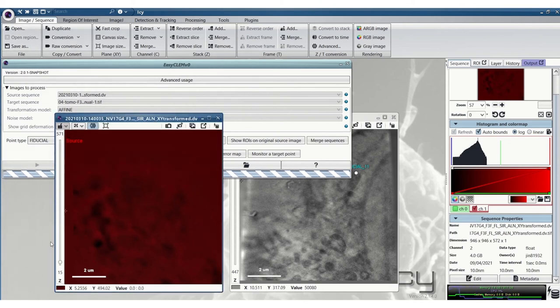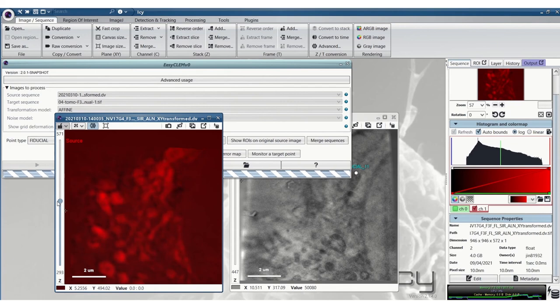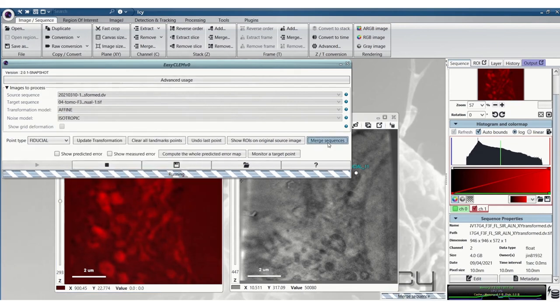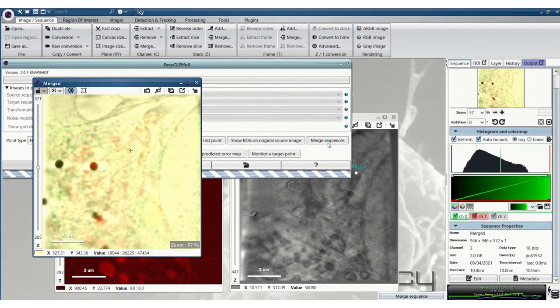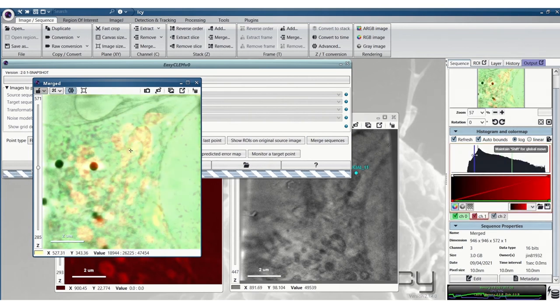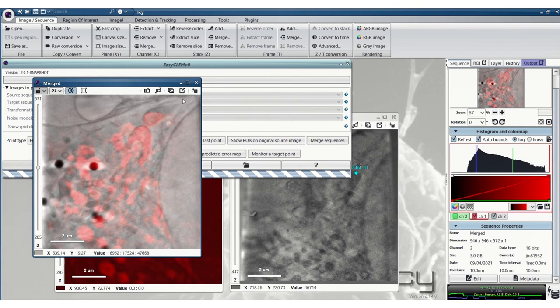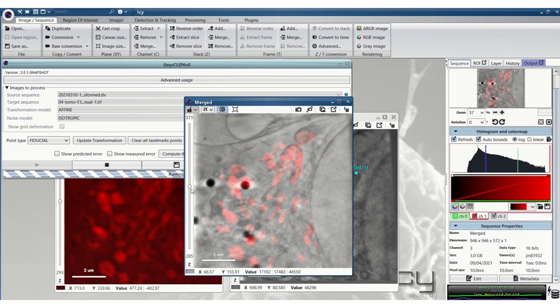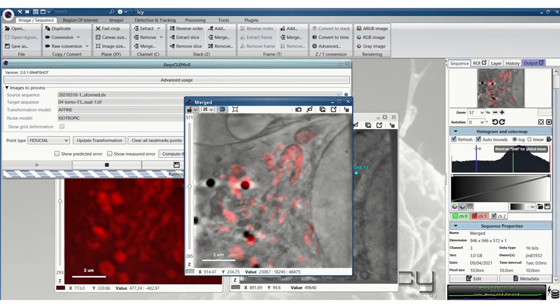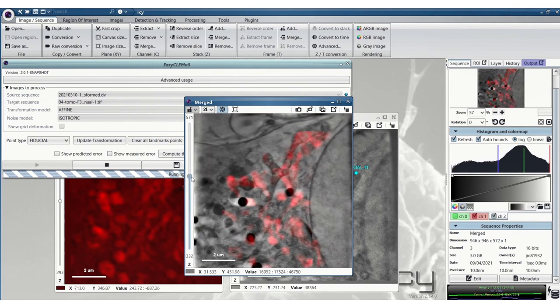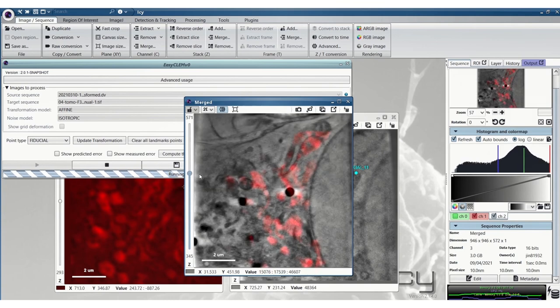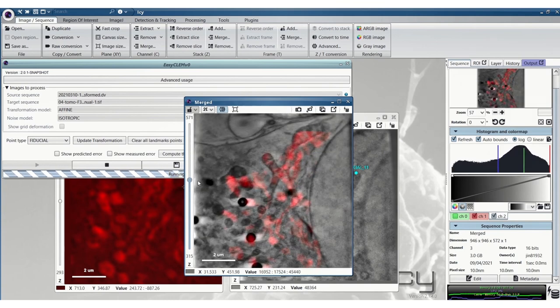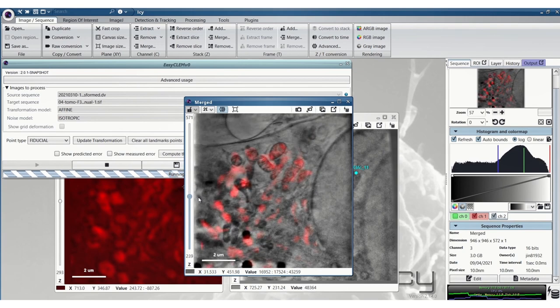But you can see in this case it's worked. It hasn't gone skewed. And then we can merge the sequences again and check how it's worked. So this seems to have worked quite well. You can see most of the mitochondria are lining up very nicely.